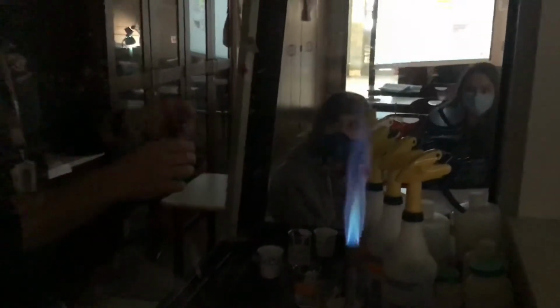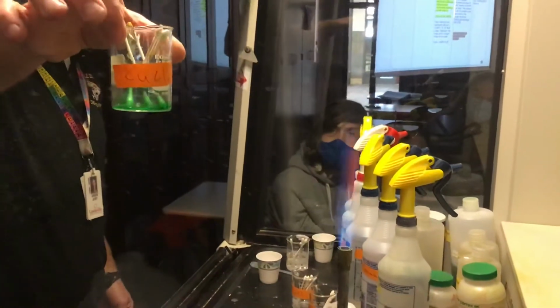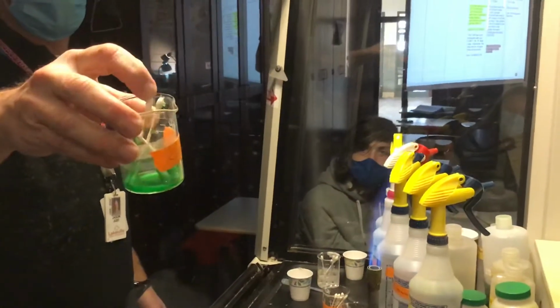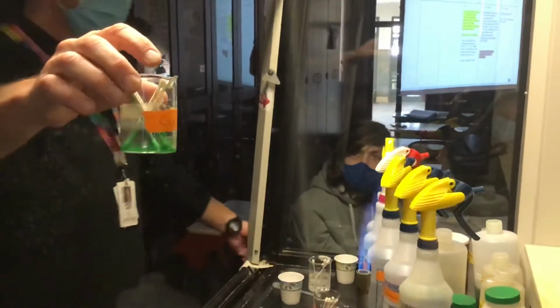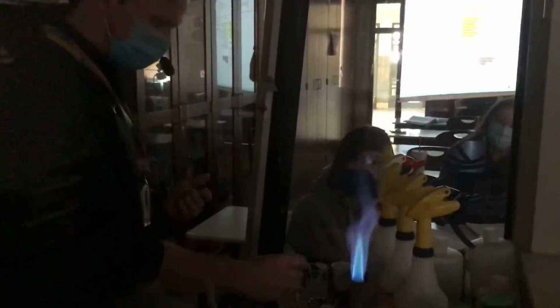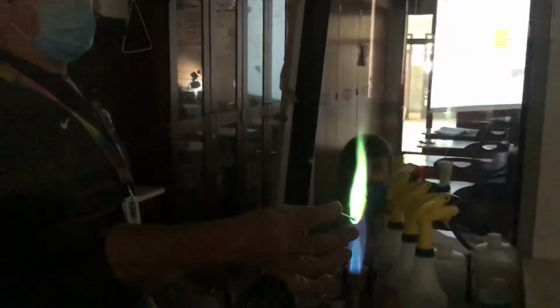Inside of small beakers here, I have several different metals, and this is one metal called copper. It's a really concentrated solution, and I put some Q-tips inside of there last night, so then it would absorb a whole bunch of the copper ions. I'm gonna take copper right now and put it into the flame, and then hopefully what we see is a specific wavelength of electromagnetic radiation being shown off by copper.